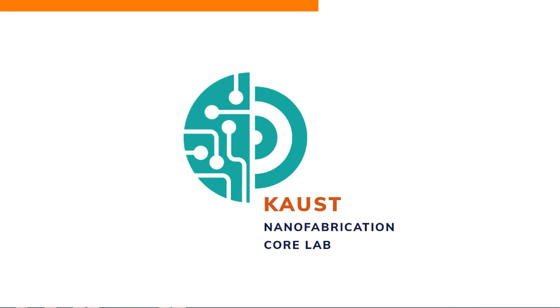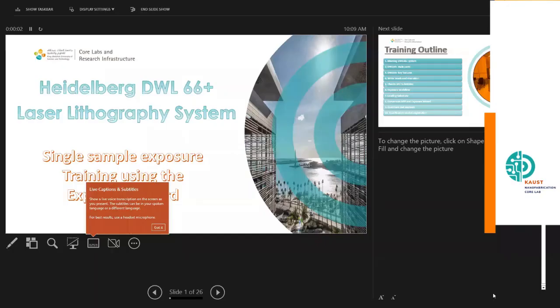Starting with the first one, going into presentation mode. As I said, this is the new system. The name of the system from the company is Heidelberg DWL66+, and it's a laser lithography system. The training for today is going to talk mainly about single sample exposure, and for that we will be using the exposure wizard. I forgot to say, if you have any question, just speak out loud.